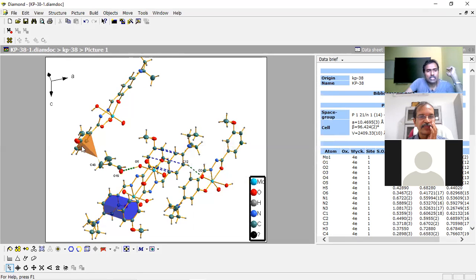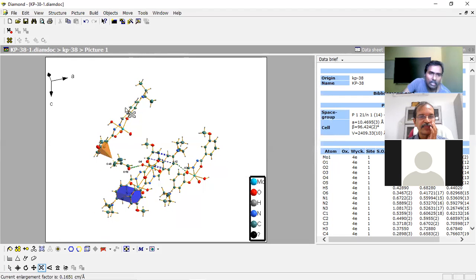And to represent this, if it is CG3, this is CG3. If you want to put CG3 here, then you can go to Paint. After saving this, you can go to Paint, and there you can use the text tool and write very near to this, CG3. Here CG3, CG4, and those things, we cannot label here. Okay, then after that we can bring it to normal, and then we have to take the high quality picture.